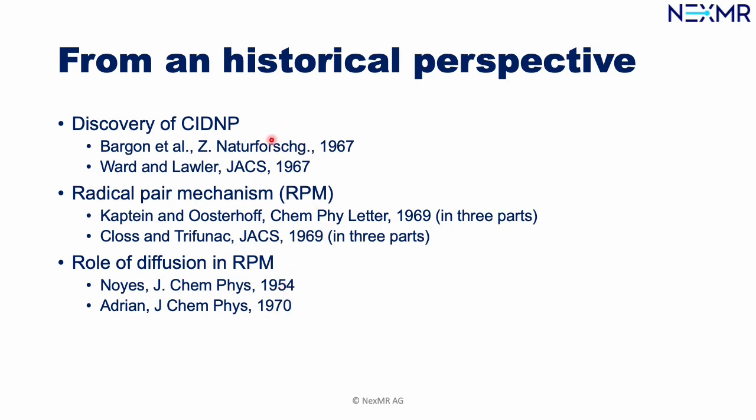And looking at it is very interesting as well to understand how people discover something new and how they so quickly understand what is happening, because you see here there is a span of three years. This is quite amazing to read, and there's also a lot of work from Fischer that you can look at to have a good understanding of photo-CIDNP.